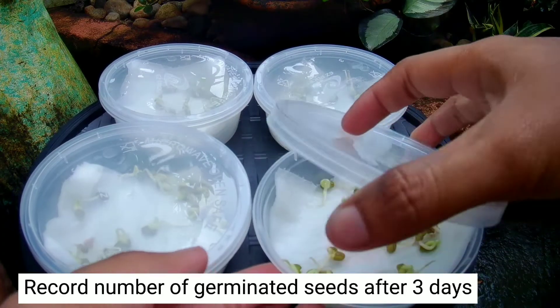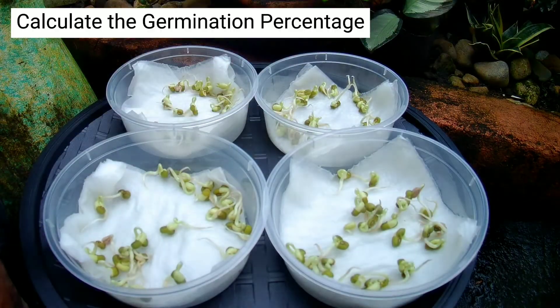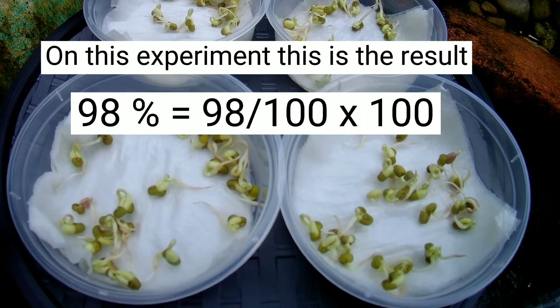Wait for seeds to germinate. Record the number of germinated seeds after three days. Calculate the germination percentage using this formula. On this experiment, this is the result.